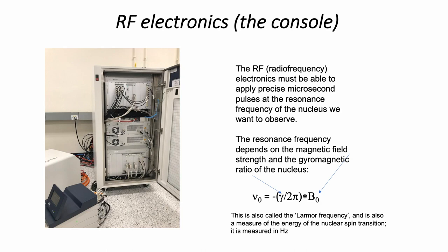So you've got this console. It's got amplifiers in there. 100-watt amplifiers is pretty much the standard. Actually, I shouldn't even say that's the standard. I think ours have 500-watt amplifiers in there.